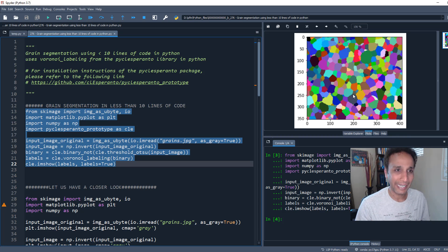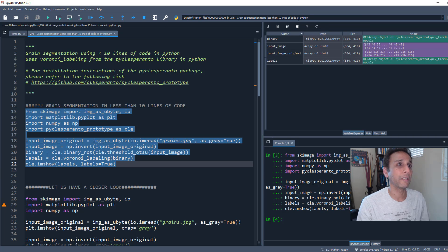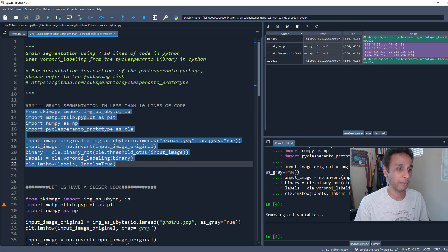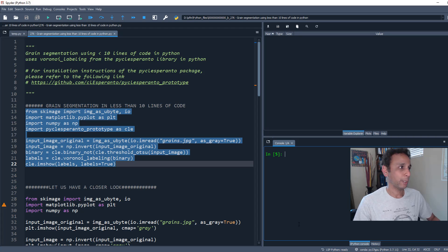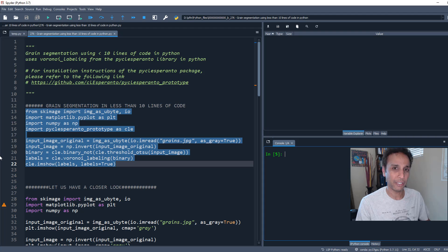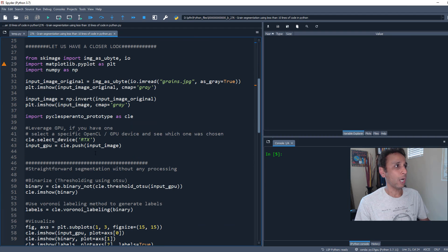Let's dig a bit deeper. Let's remove every variable and image and start with a clean slate. I'm using Python 3.7.11.